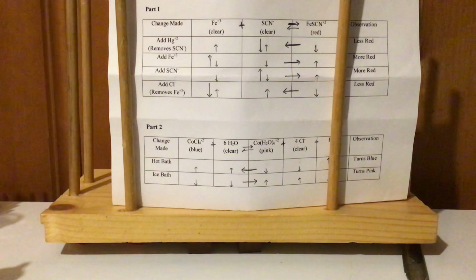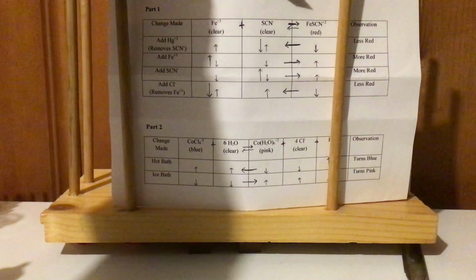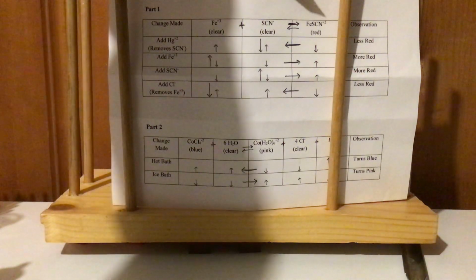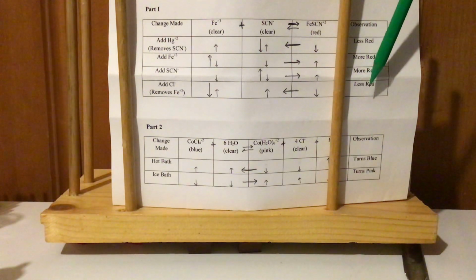So last time we were working with a reaction where Fe plus 3 combined with SCN minus to form FeSCN plus 2. This was clear, and this turned red. And I know it was a little bit different data table, but I'm going to use this different table to highlight some things and talk about what we're going to call equilibrium shifts. But anyway, we saw with the first thing added, it got less red. The second and third thing, it got more red. And the fourth thing, it got less red.